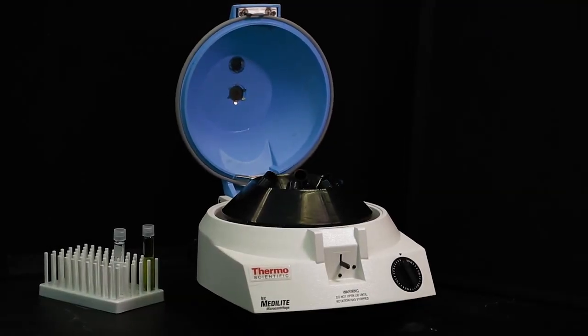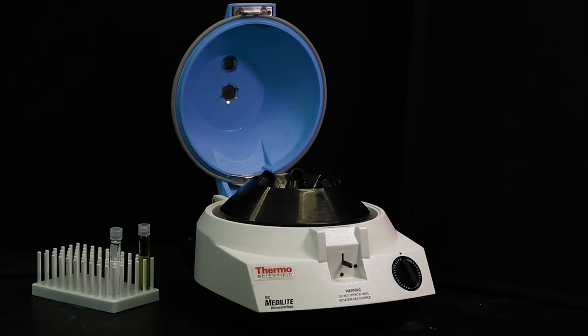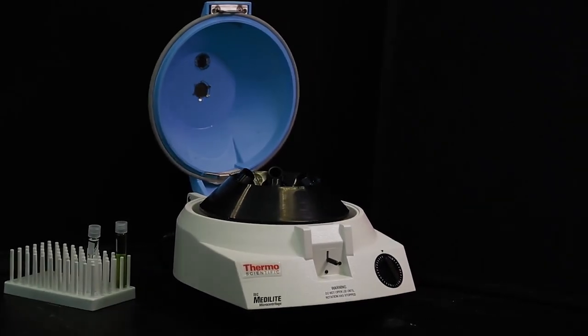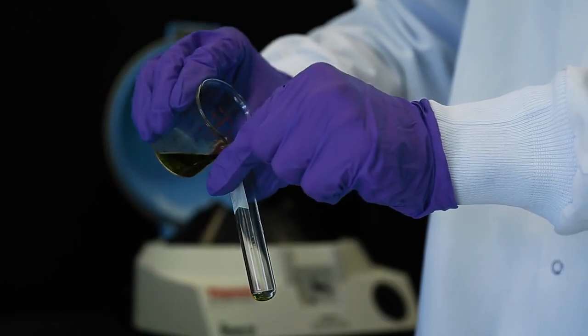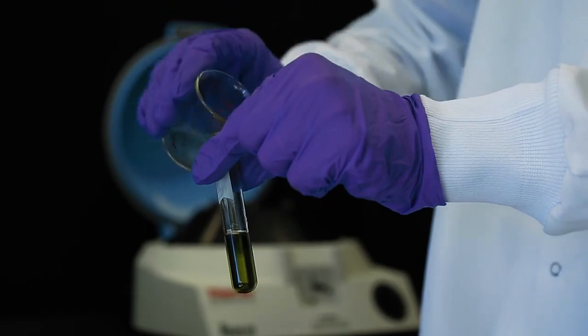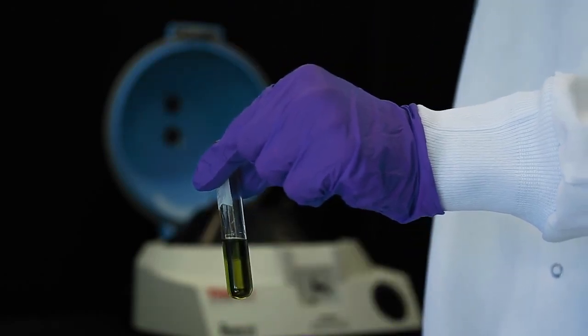Centrifuges can be used to separate immiscible liquids into layers based on density. This video demonstrates the proper use of a centrifuge. Pour the liquid you wish to separate into a test tube. Do not pour all the way to the top.